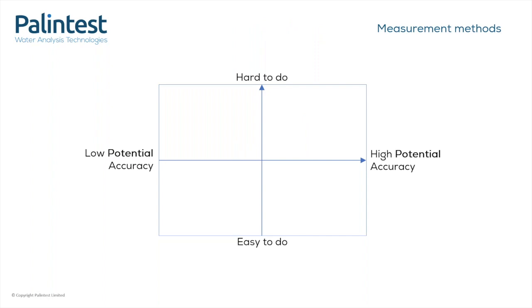There's such a wide range of testing methods for analysing water in fields that choosing the right one for you can be tough, as not all of the methods are created equal. The general decision is between how easy it is to use and how reliable and accurate the data you get is, and which is most suitable for the application in which you are working.